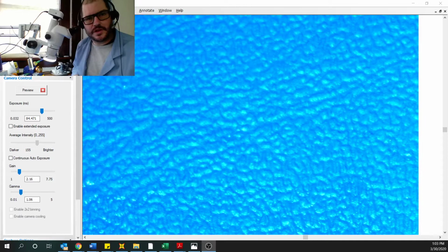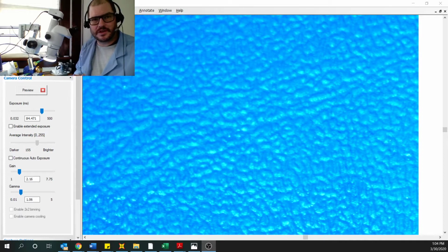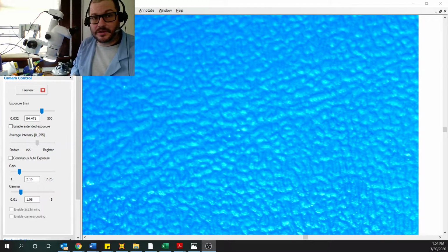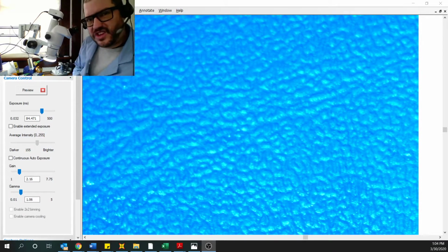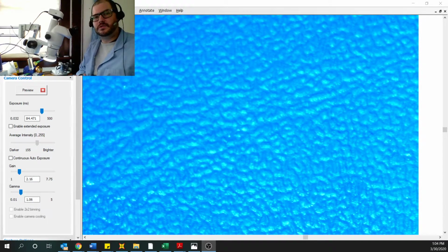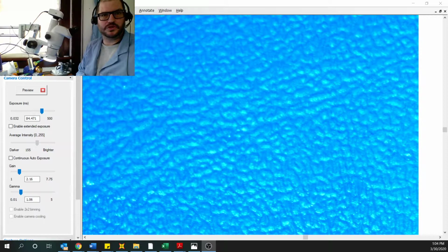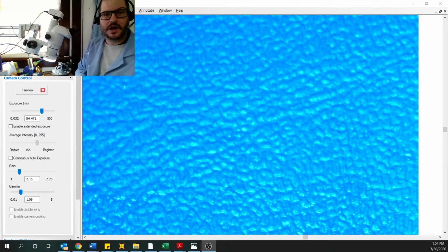I thought I'd take this video to take a little bit of some time. We've made already a whole bunch of videos where we've looked at stuff underneath the microscope, but I haven't really explained a lot about the different parts of the microscope and what they are, and especially how it in general works. So I thought I'd take this video to get a little sciency, if you will, and talk to you about microscopes. Now, the microscope, by its basic definition, is a tool which is used to make small things look really big, at least much bigger on the screen or through the eyepieces.